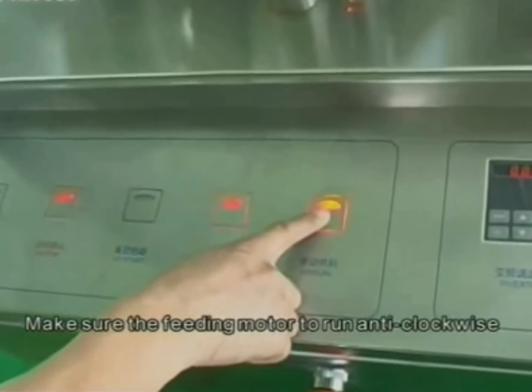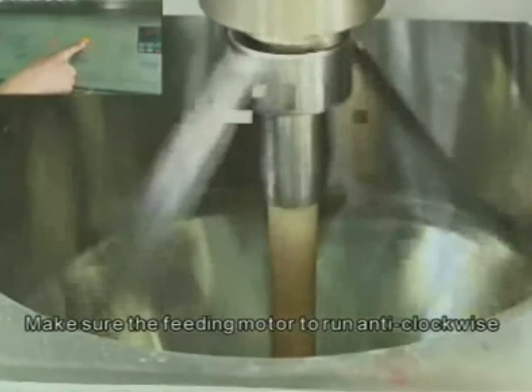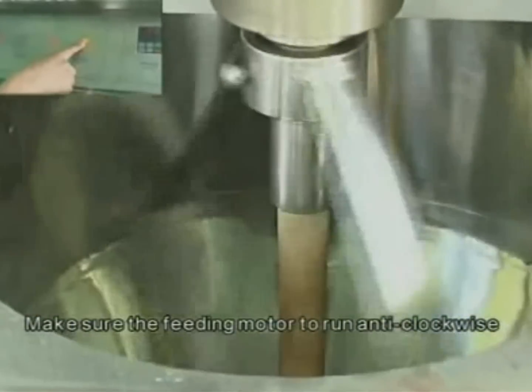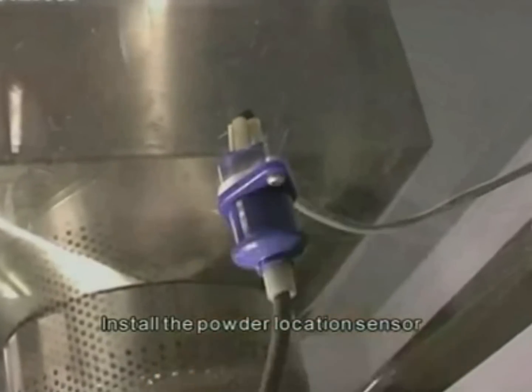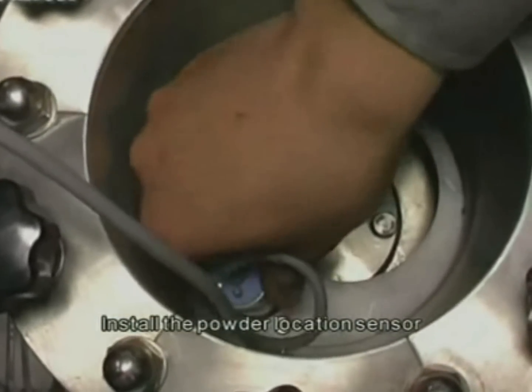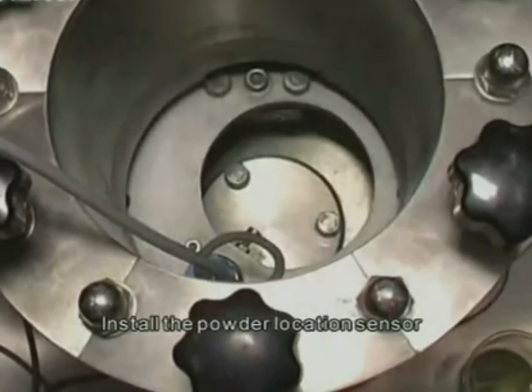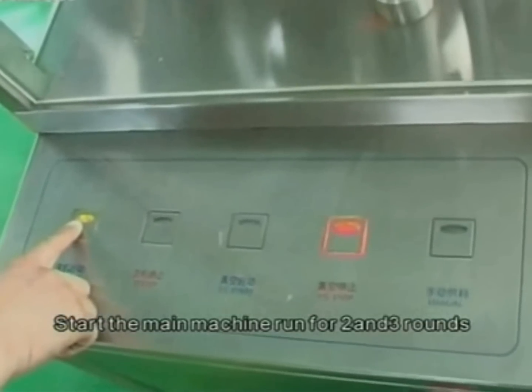Make sure the feeding motor is running anti-clockwise. Install the powder location sensor. Start the main machine and run for two to three rounds.